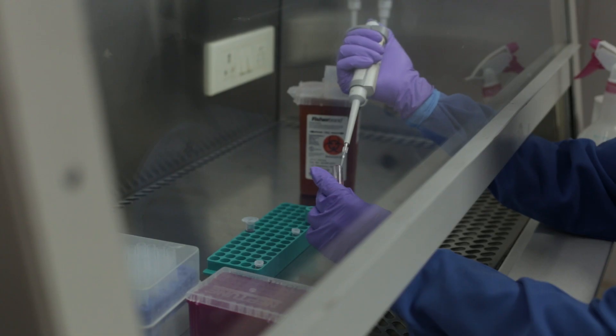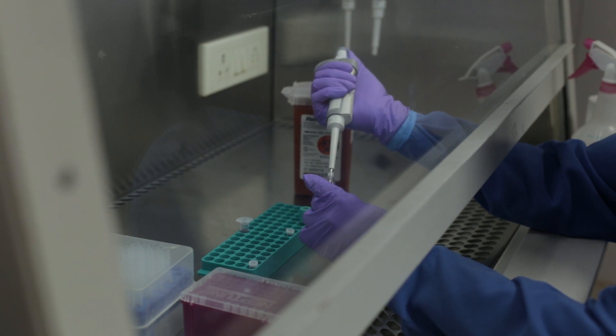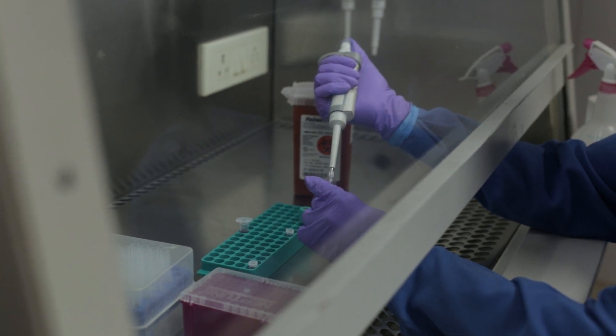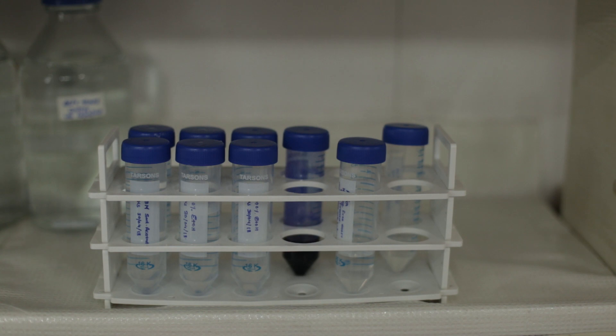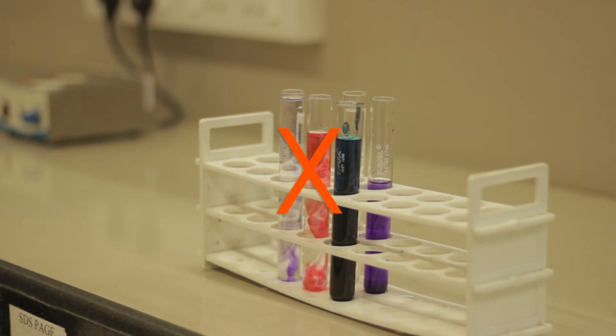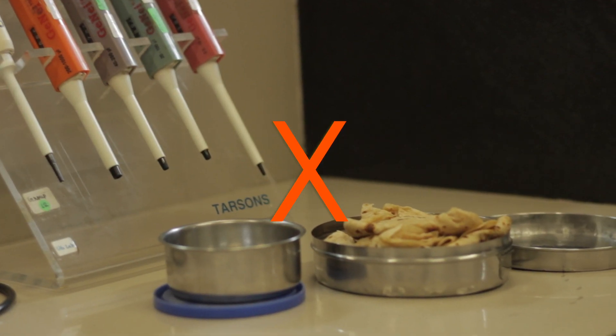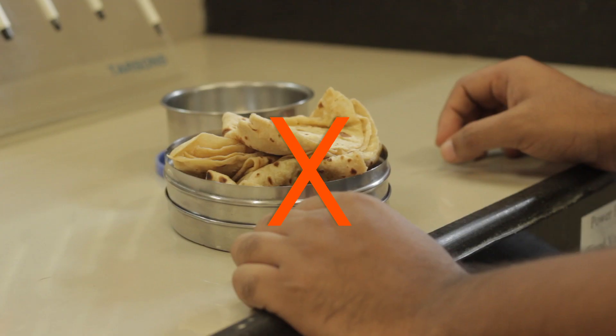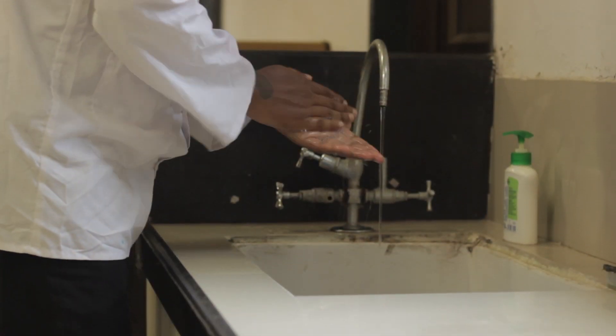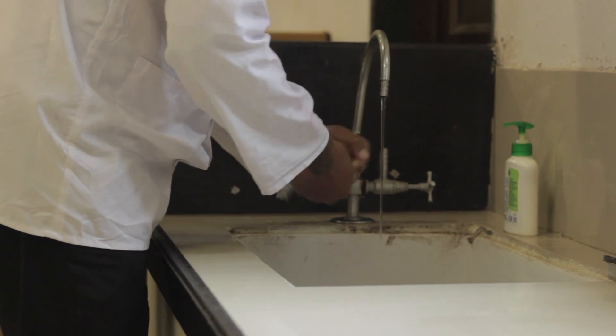Open containers of vials inside the biosafety cabinet whenever there is a risk of aerosol exposure. Containers used for storing biospecimens must be plastic. Glass material can easily break and cause a spill. Do not bring food and drinks into the laboratory. Wash hands after completion of the work and before leaving the laboratory.